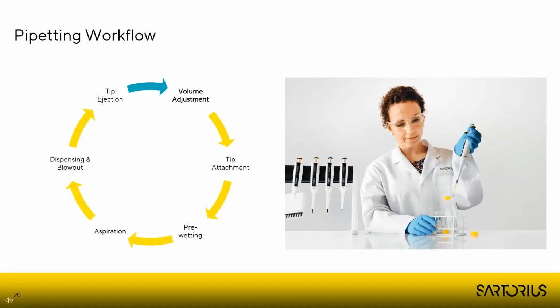Pipetting definitely is a repetitive task, so plan the work in a way that you can utilize the same consumables the maximum time. So use helpful features like multi-dispensing, pipetting all diluents in a sequence, so you can use one tip, or one set of tips if you're using a multi-channel pipette. Planning in advance definitely can help here. Maybe you'll find a way to minimize time spent on pipetting at the same time as you're reducing the number of consumables used.